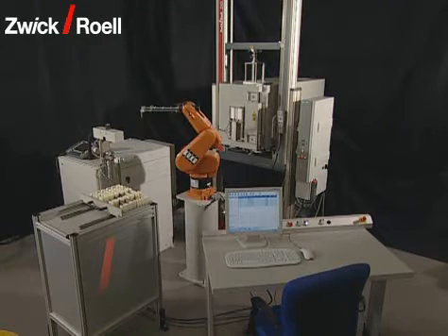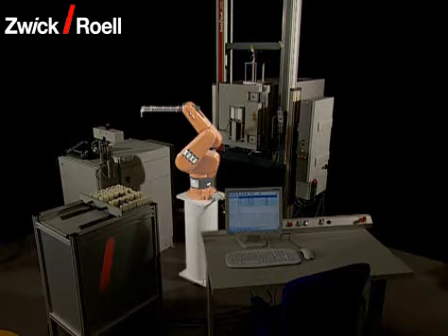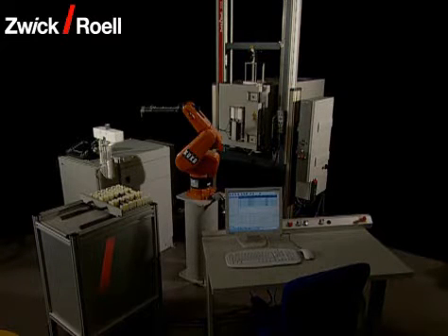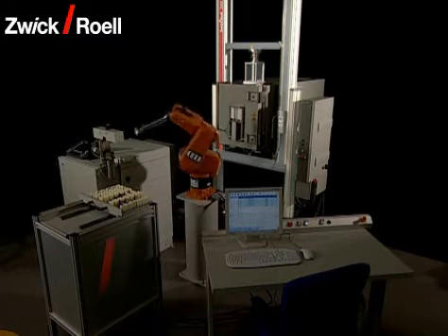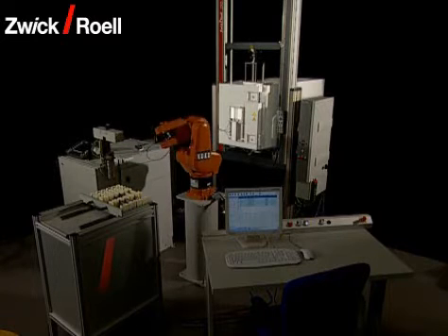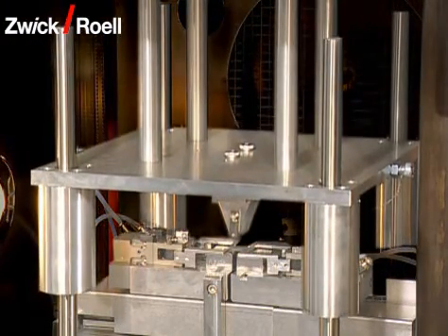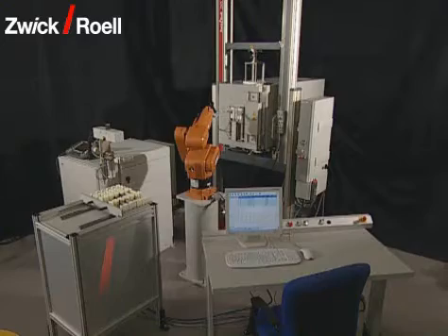The testing system consists of the following single components: the robot with vacuum gripper for the transport of the specimens to the different stations; the specimen magazine for 240 specimens of different sizes; the cross-section measuring unit for the determination of specimen width and thickness; the material testing machine with a maximum force of 5 kN; the temperature chamber integrated into the work area with a temperature range from room temperature up to 180 degrees Celsius; the motor adjustable bending device; and the disposal of the specimen remains in two different containers.